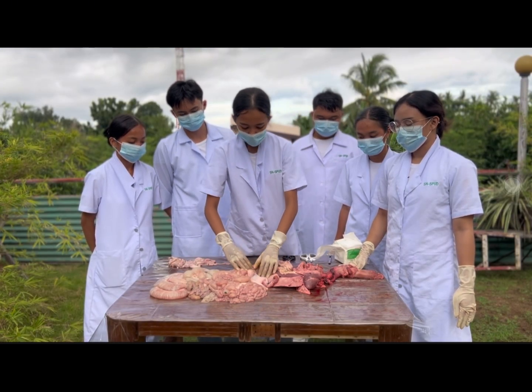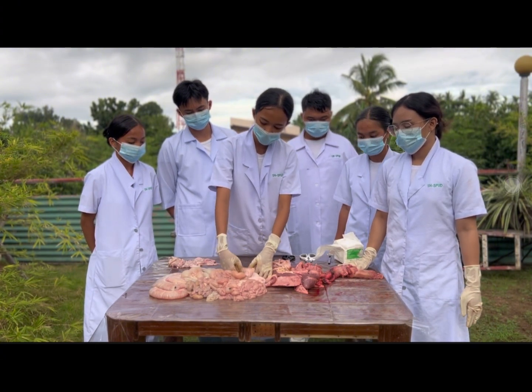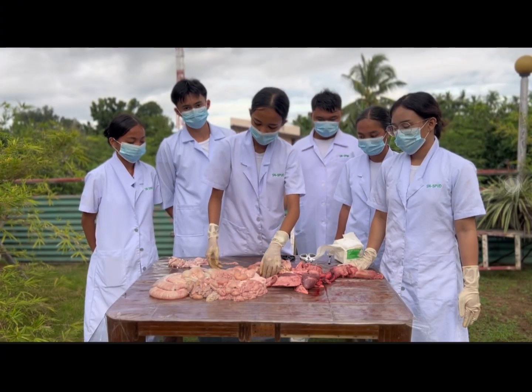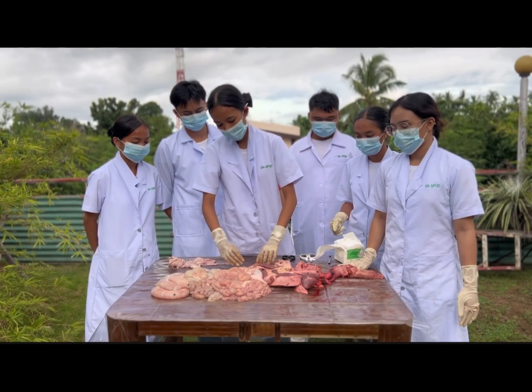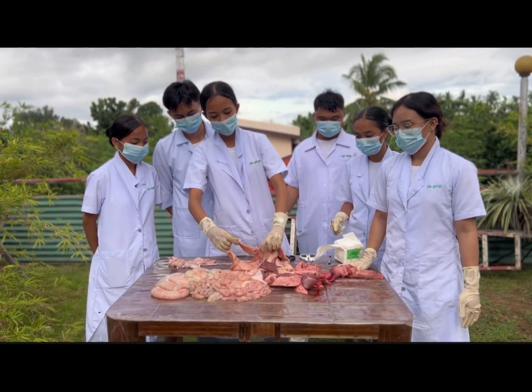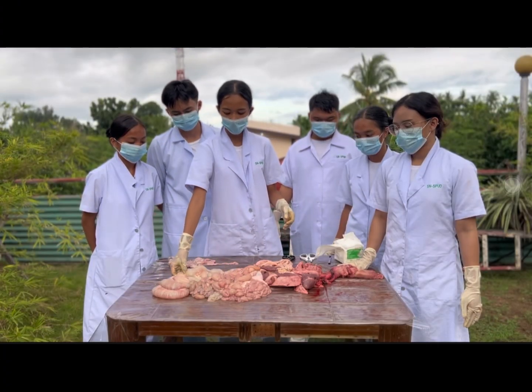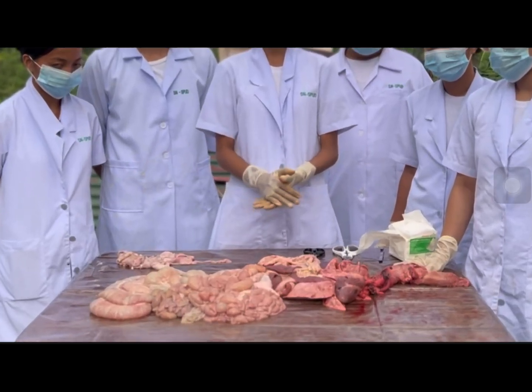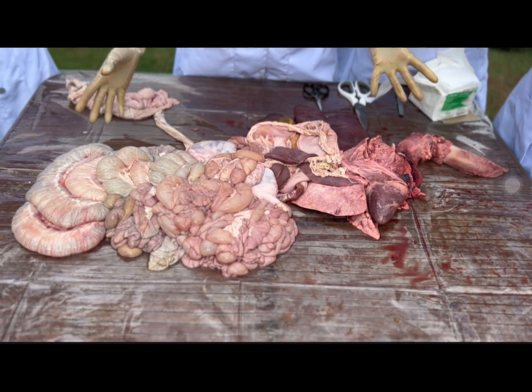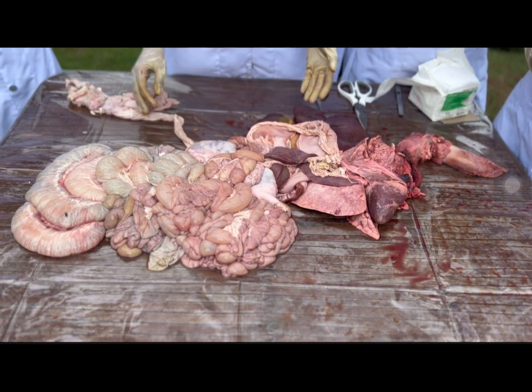Now let's move on to the inferior part of the stomach, where you can see here the pancreas together with a pair of kidneys. Now we can see here the connection between the stomach and the small intestine. You can see here the large intestine and down to the anus. Now let us separate them for closer examination and to know about their structures and function.